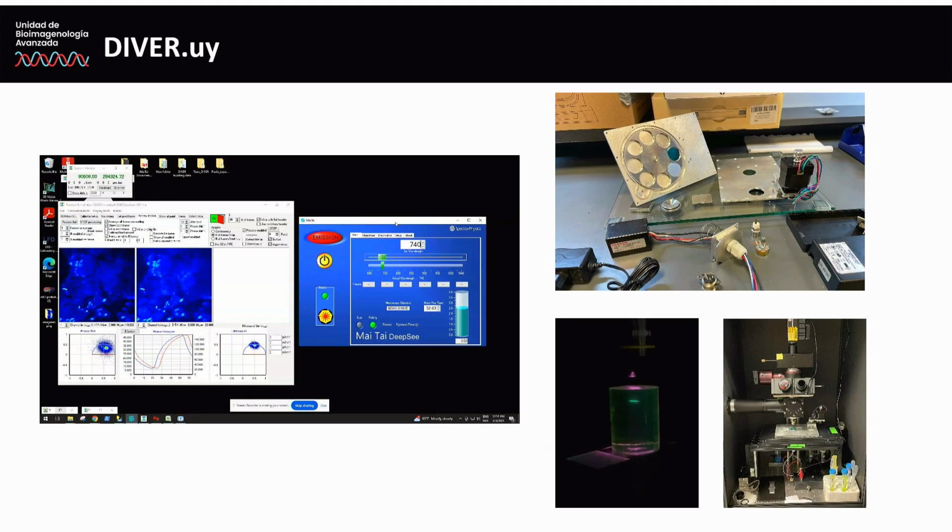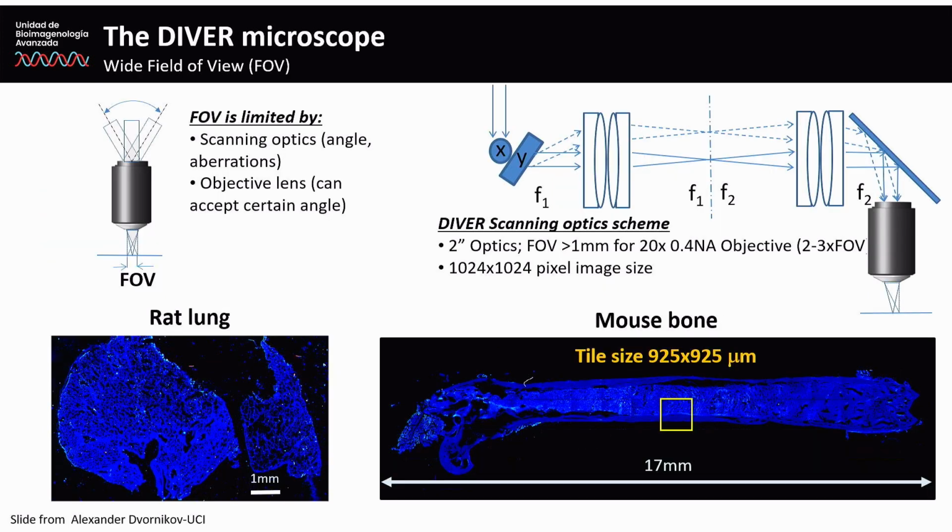And basically, this technology requires you to build all the mechanics in order to put together a microscope that looks like this. And this is the software performing and scanning a piece of sample for calibration purposes. So what are the benefits of this technology?